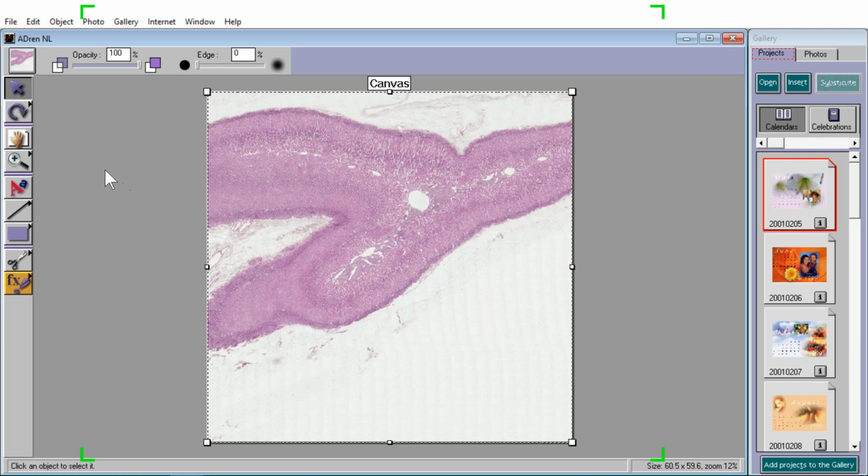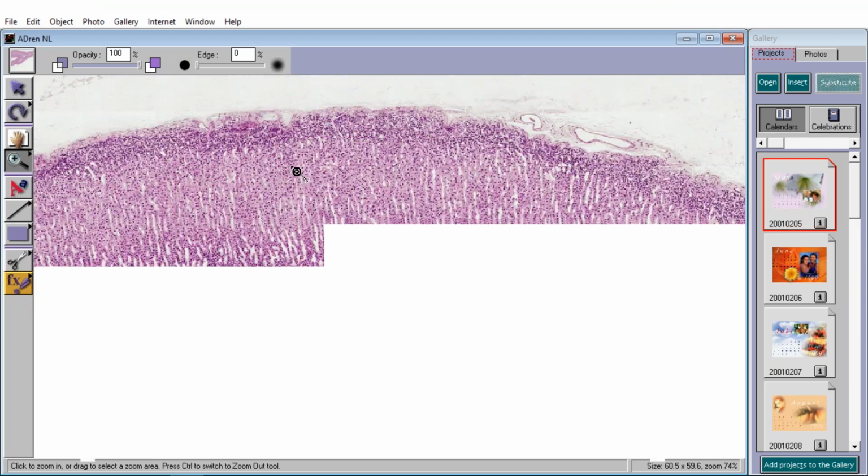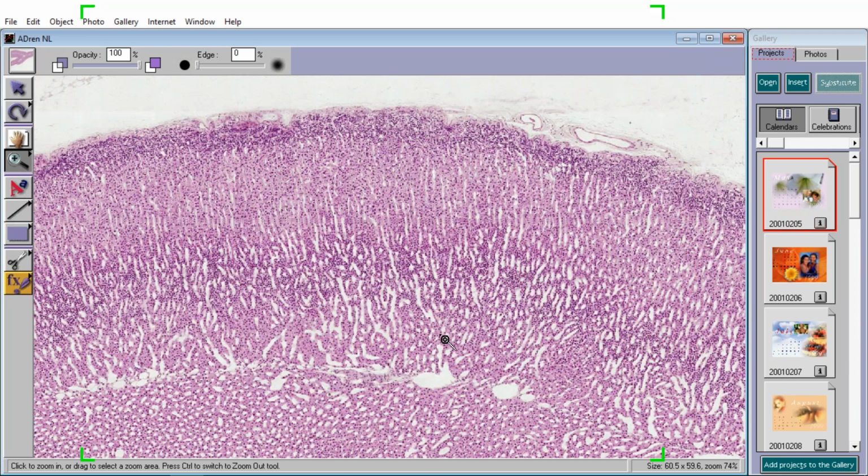So here's what I'm going to do. I think the microscope is working. I'm going to make it a little bit bigger for you because you really can't see cells here. So I'm going to zoom in on just this part of the bird's wing. Now I'm going to ask you a question. Can you see the slide? I'm hoping some people will join in and say yes or no. Can you see the microscopic slide? Good, I got yeses. Thank you for responding.